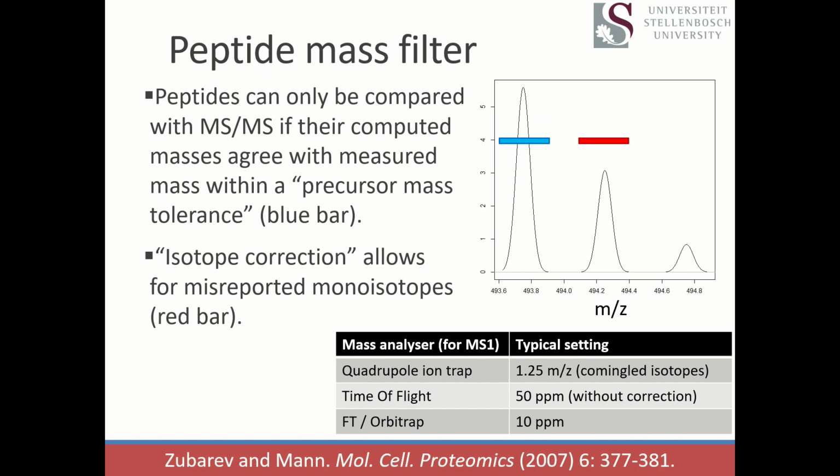All right. Next, let's get on to peptide mass filter. I have to say that you guys who have come into the proteomics field in a time of high-resolution mass measurement have it so much better than the very bad old days. In the days of the first instruments sold explicitly for proteomics, things like the old LCQ and stuff like that, I mean, yeah, the triple quads could also be used for it back in the day, but when people really started going hardcore for proteomics, they'd start using LCQs for this. And the LCQ could produce 2,000 tandem mass spectra in the space of like an hour-long gradient. And we were like, that's amazing! It was so much better.